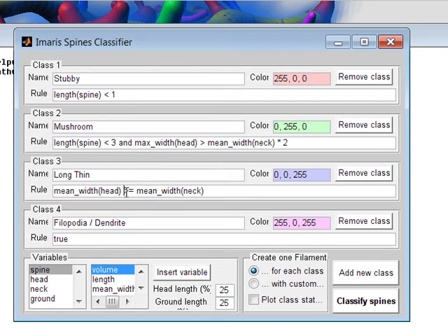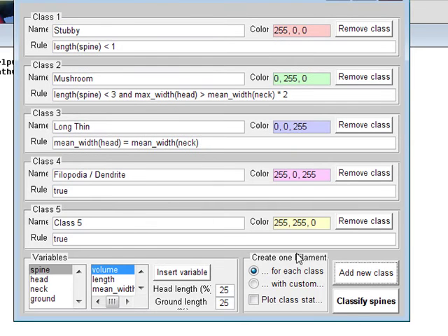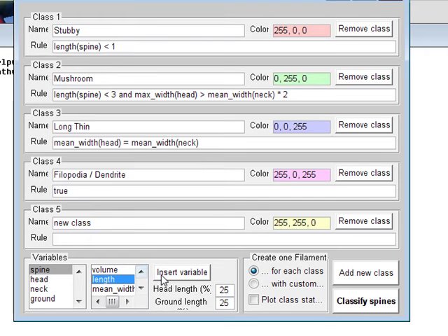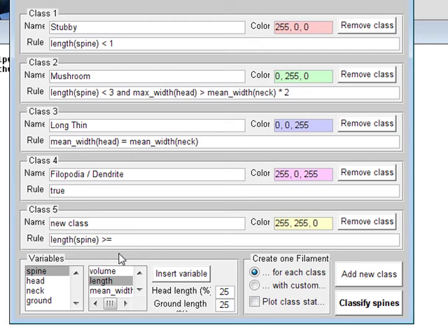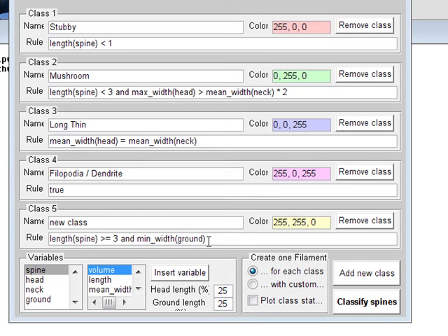To customise the classification, you can edit the current rule by simply clicking on the rule line. Otherwise, you can create a new rule by clicking on the Add New Class button. Click on the name line and enter a new name. To set a new rule, combine the morphological parameters spine, head, neck, or ground with the predefined variables volume, length, or width. The default classification rules show the pattern of syntax needed to complete these statements.